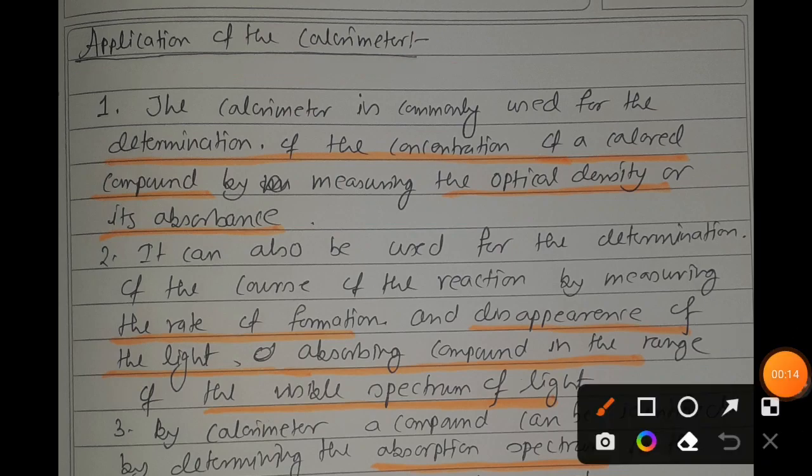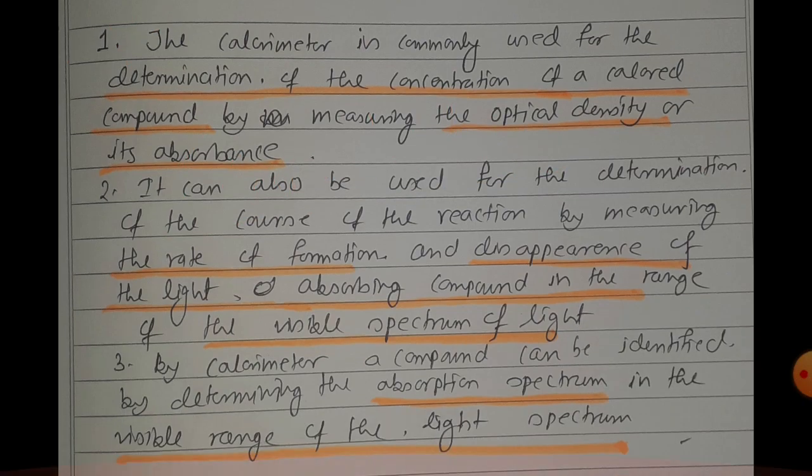So the first application is very common to us, we have discussed it multiple times, that is it has the ability to derive the concentration of the colored compound by determining the absorbance or the optical density.